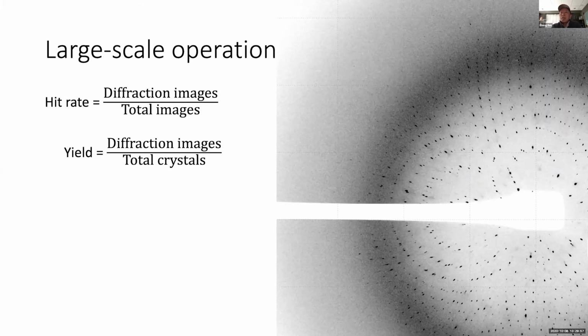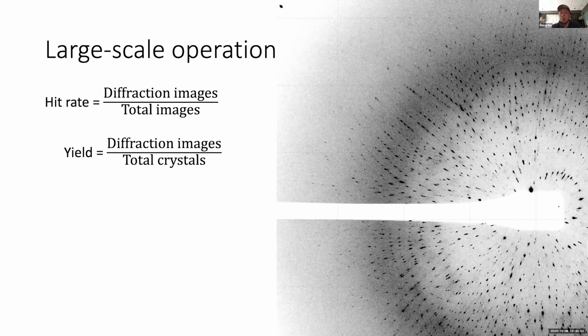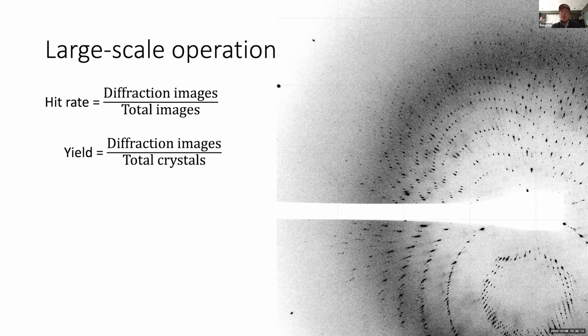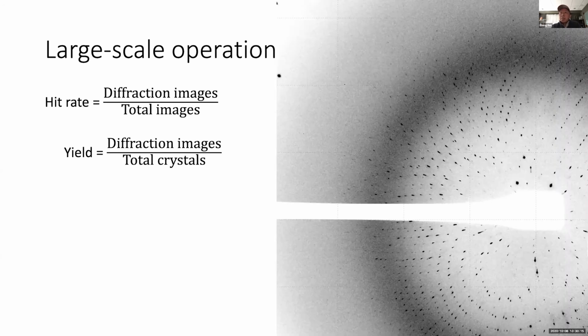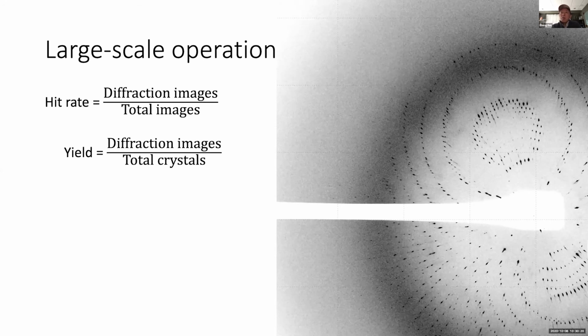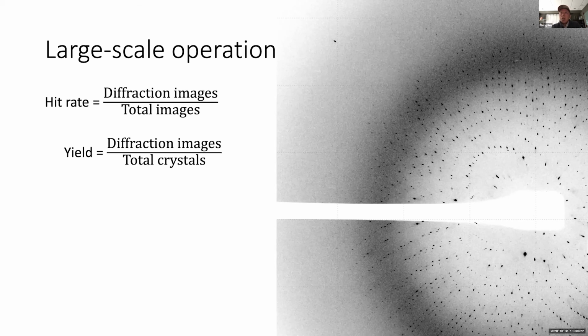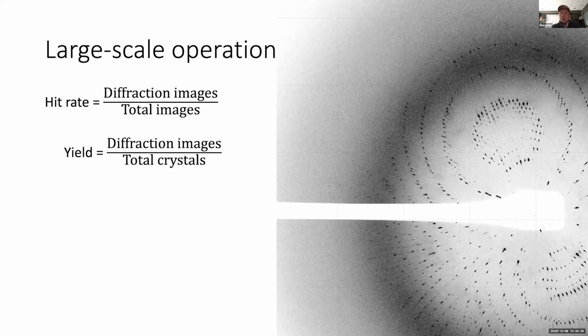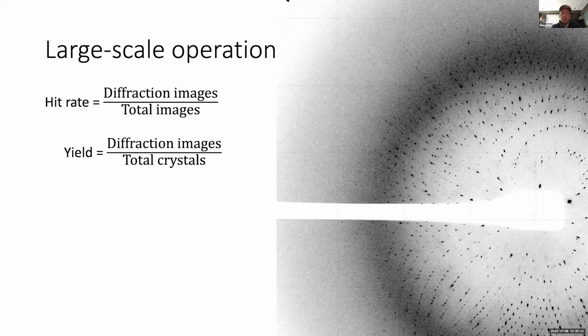May I also mention that we find, and I do not have the hard statistics yet, but my impression, because I have done Laue diffraction for decades, is that the in situ diffraction significantly reduces the mosaic spread of the crystal, because every crystal will only diffract once in its virgin state. So the diffraction is usually the best at the very first exposure.